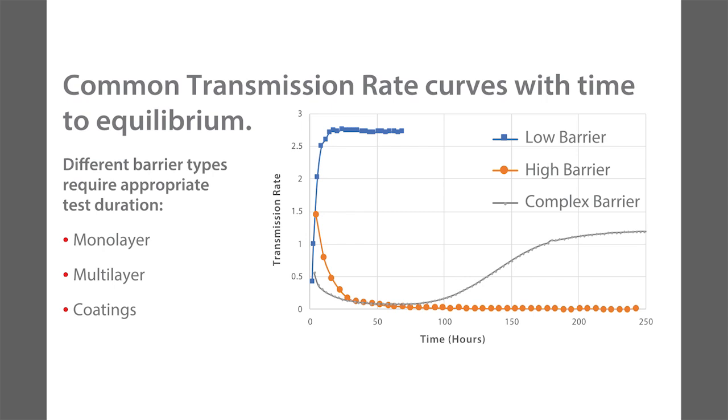As a side comment, in our laboratory, to guarantee that we're really at equilibrium, we set up a criterion that we want a steady value over 24 hours. So even if a test looks done in a matter of, let's say, 6 hours, we're still going to run a little longer, just for extra assurance that it's not changing.